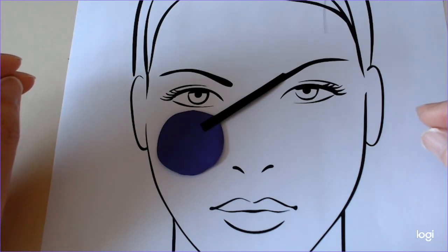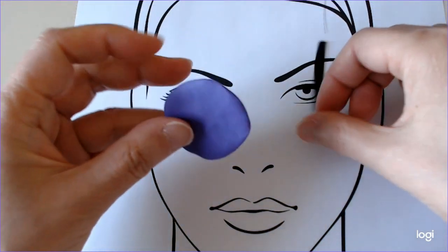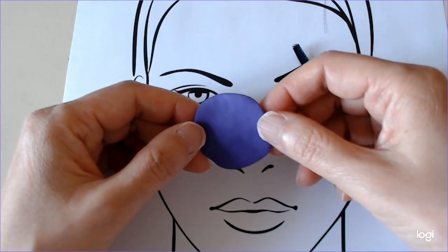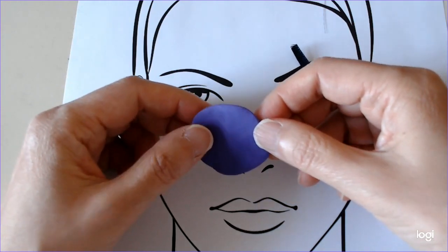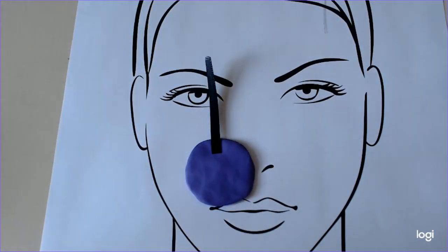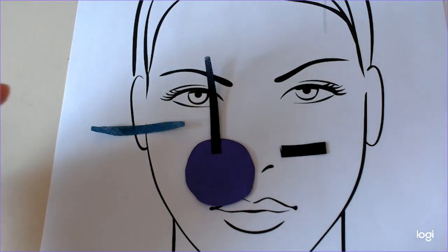Sometimes, however, we don't know which surface is the front and which the back. For example, if a tumour is ulcerated, the skin surface will be irregular. In that case, two sutures may be needed. You can have one long and one short, or one silk and one vicryl. Please remember that the pathologist doesn't have a surgical microscope and won't be able to see very fine sutures such as 10-O nylon.